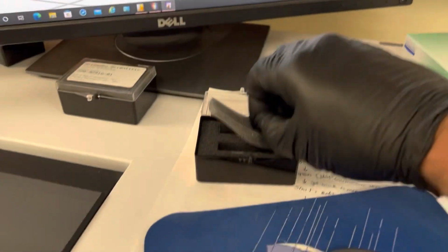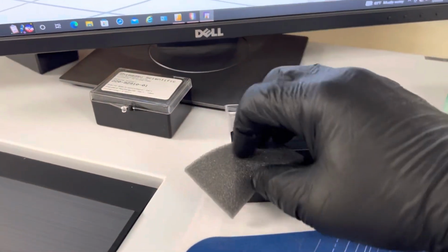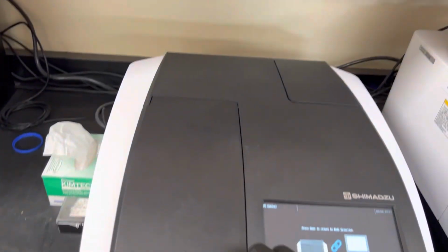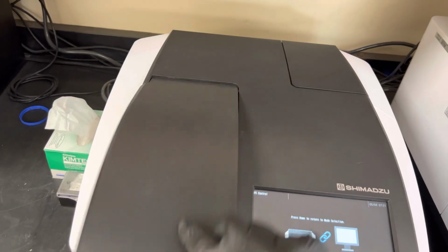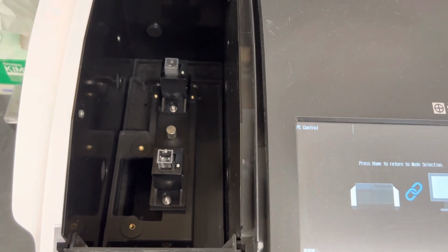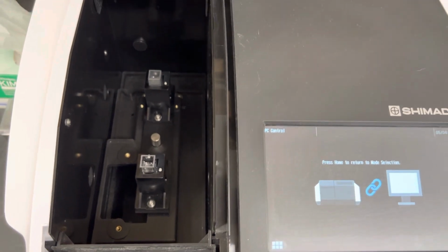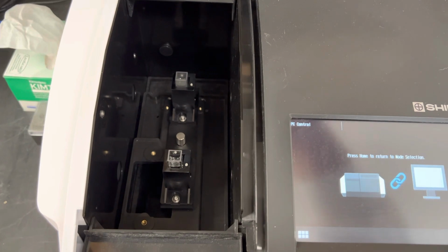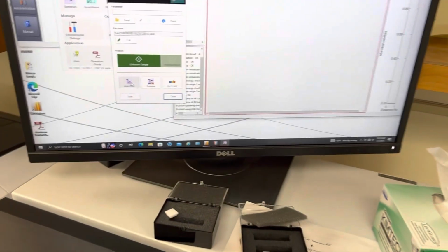All right. So you got your cells. There's only one in there. It's not in there. I'm gonna pause. Okay, I'm back. So I already got my cells cleaned up, and I put water in both cells. Both of those cells have water. Orient those in the correct direction. It's left to right is the light beam. Those are my blanks, just water.